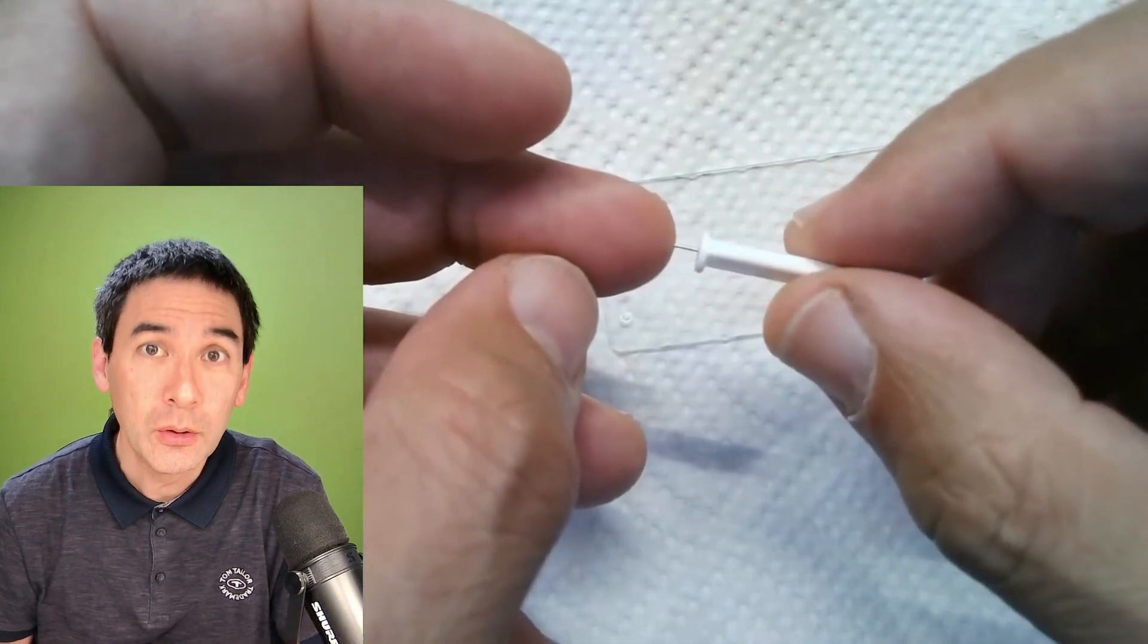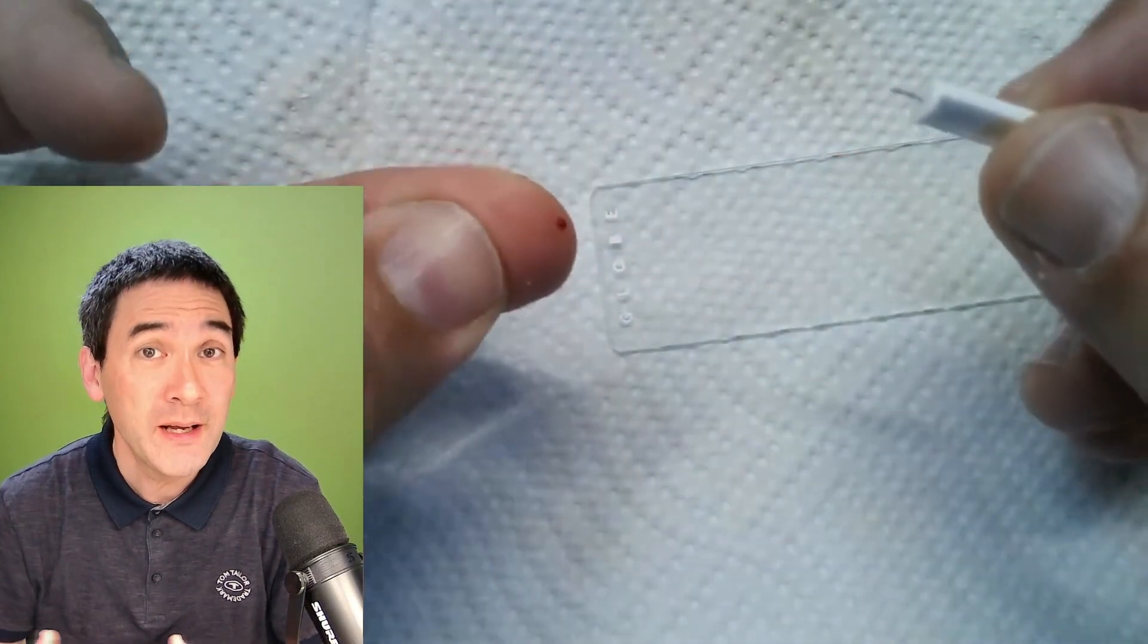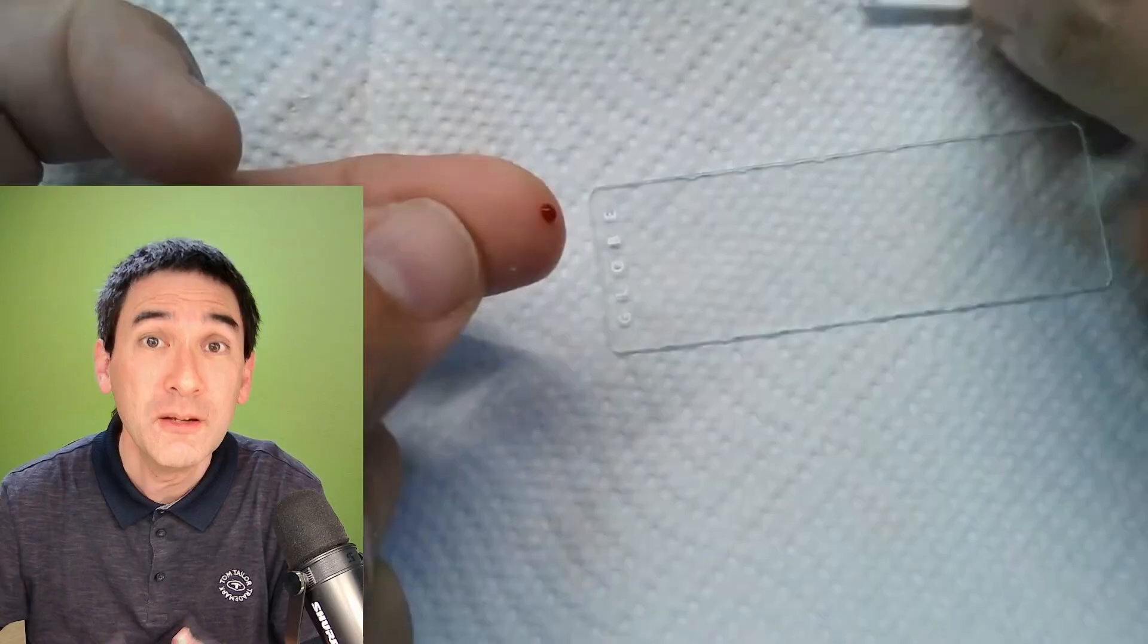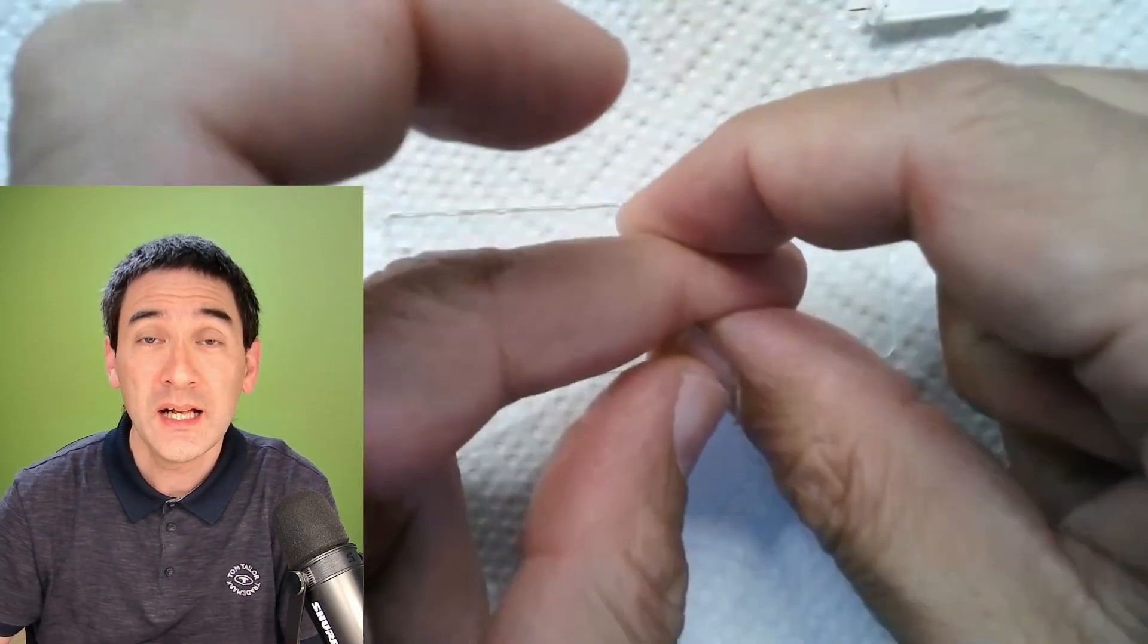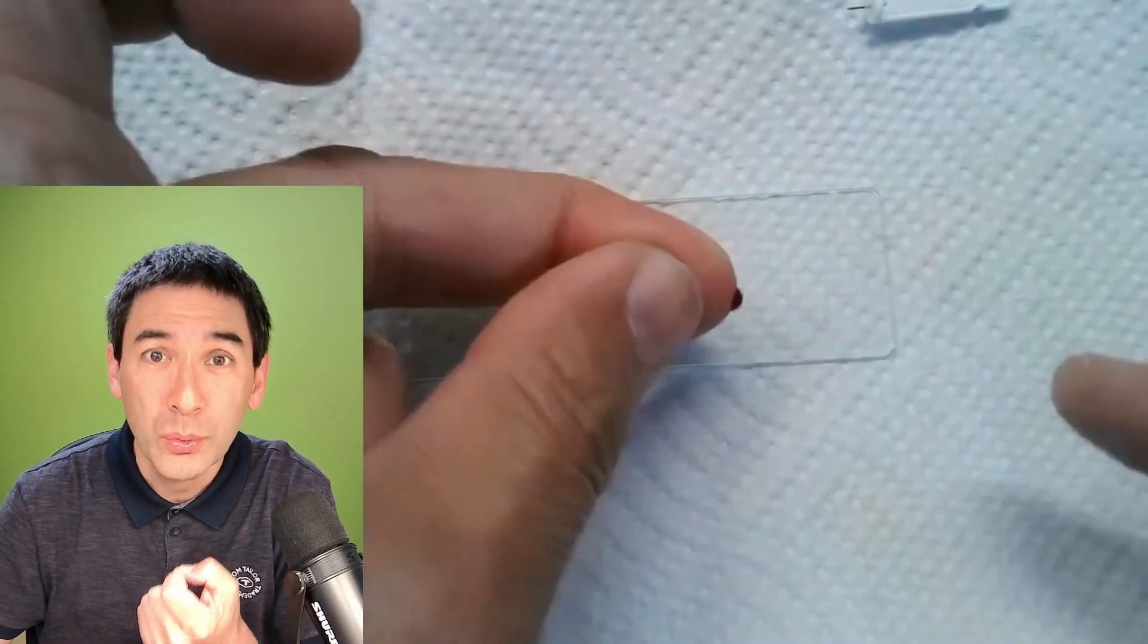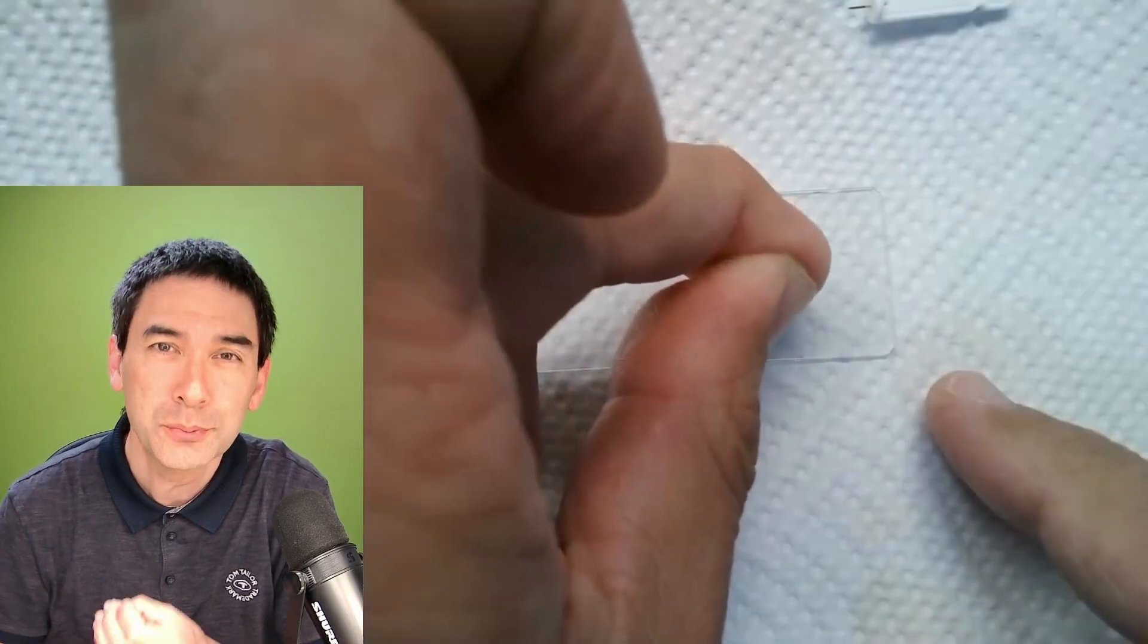You only need a very small drop of blood. As a matter of fact, too much blood makes it difficult to see the individual blood cells, and because the wound, the hole is so small, I really have to press a little bit to squeeze out a small amount of blood.